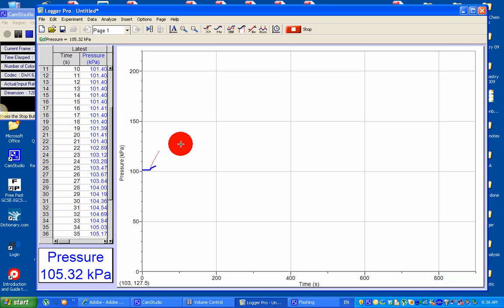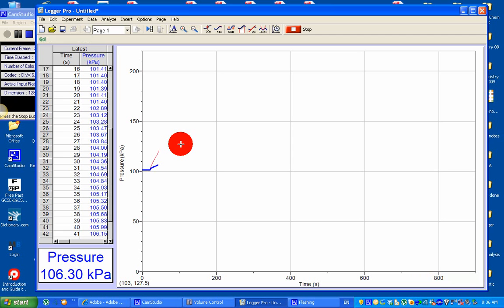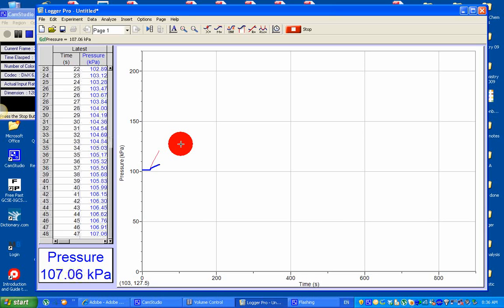I'm going to measure it for the first 20 seconds. After the first 20 seconds, I'm going to stop data collection and show you how to get the gradient. Stop data collection.